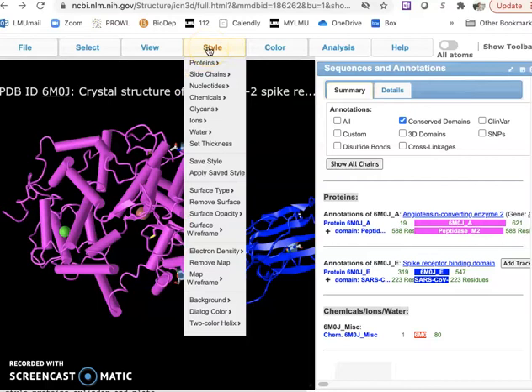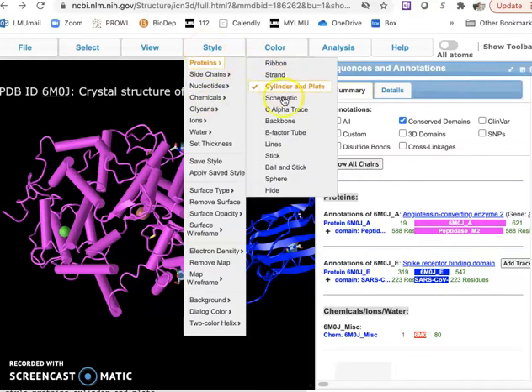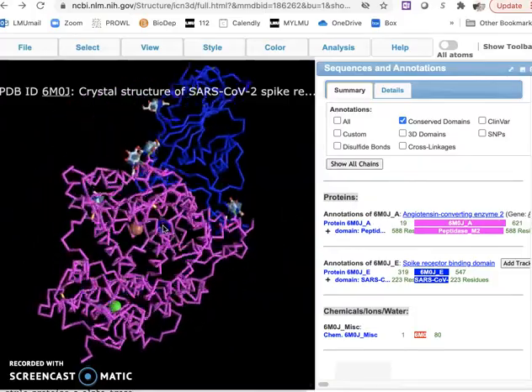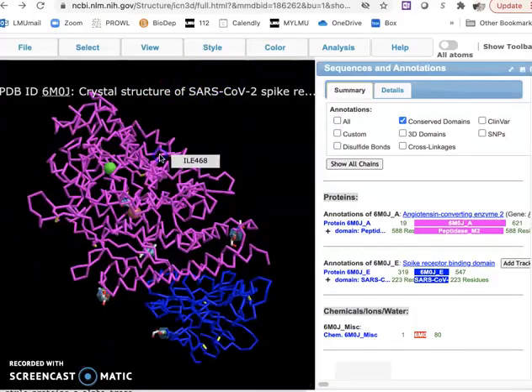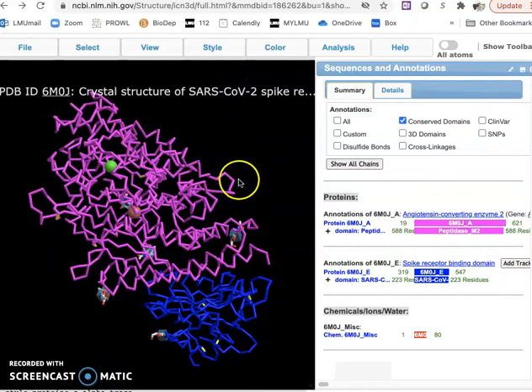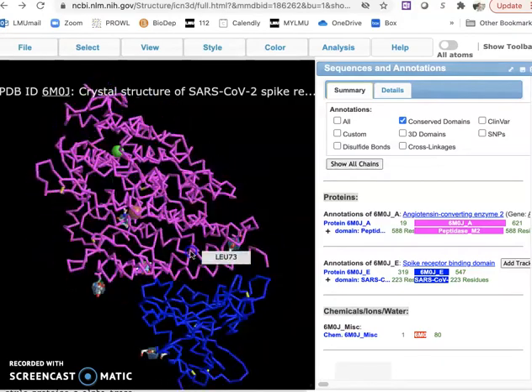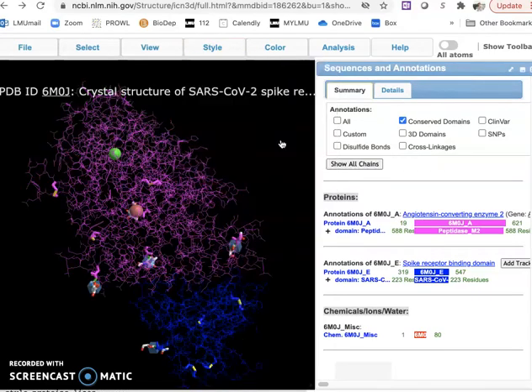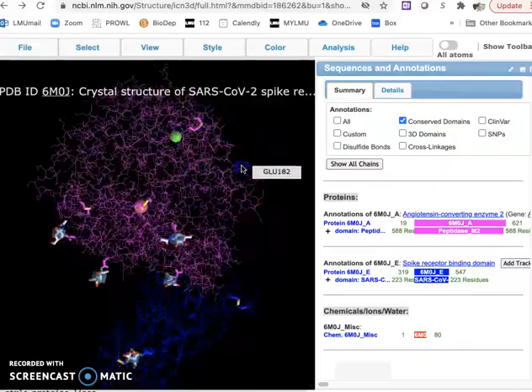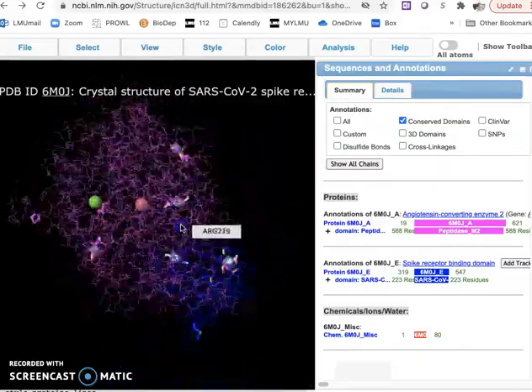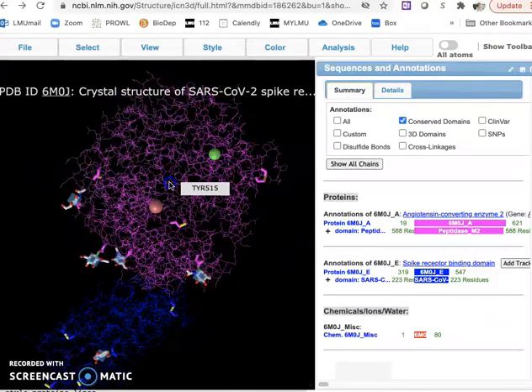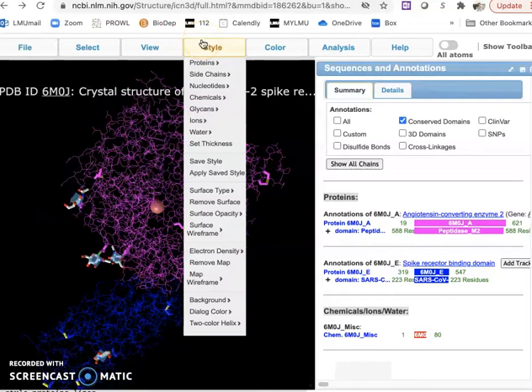Then we have alpha trace, which shows the primary structure of the protein. You could see how this N-C-C bond chain bends and the angles it creates. Then we have lines, visualizing all the bonds created in the protein. Stable bonds looks very hairy.